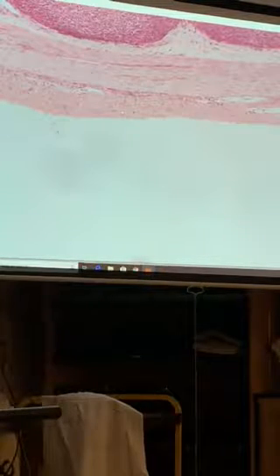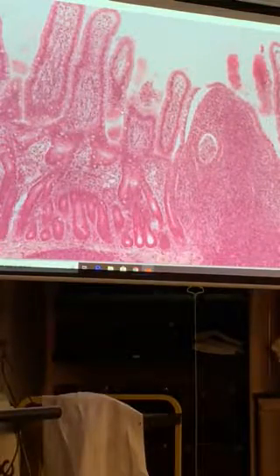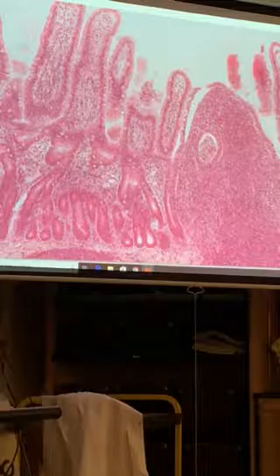Okay, questions on this slide? Anything you want to see that I didn't ask you about? No? No. I bet your every wish. That's impressive of me. Okay, so.